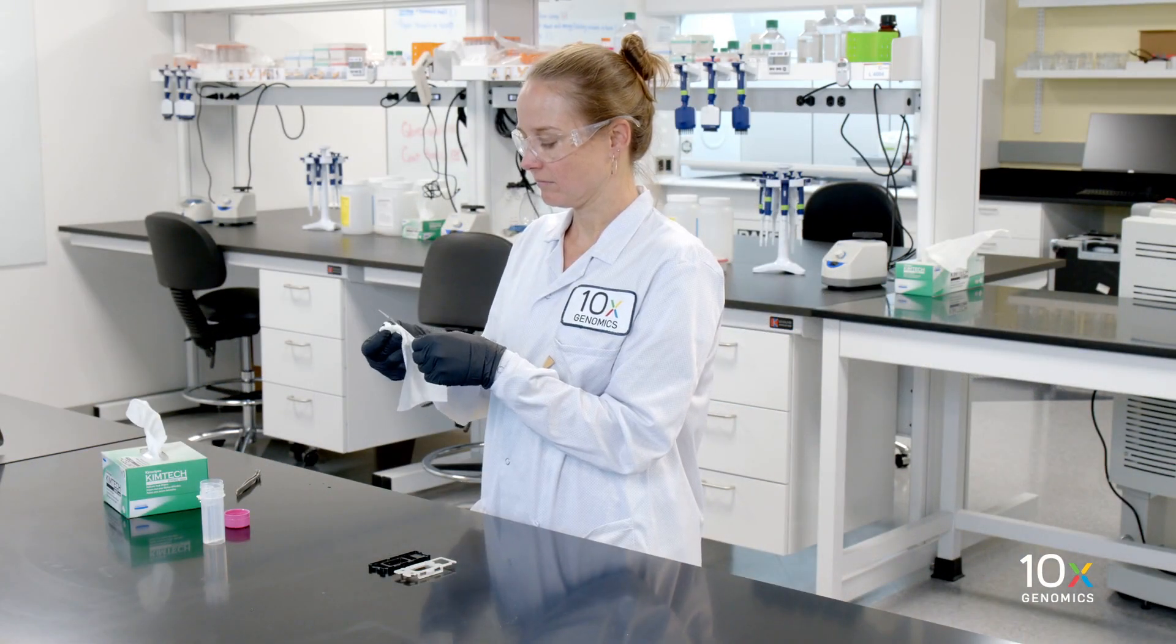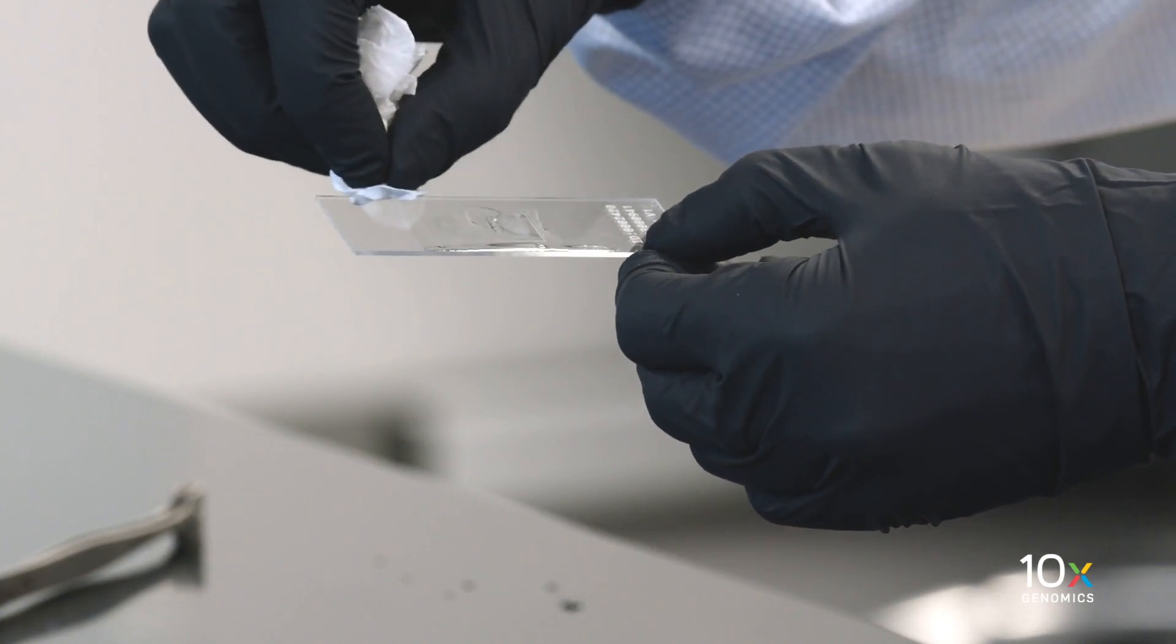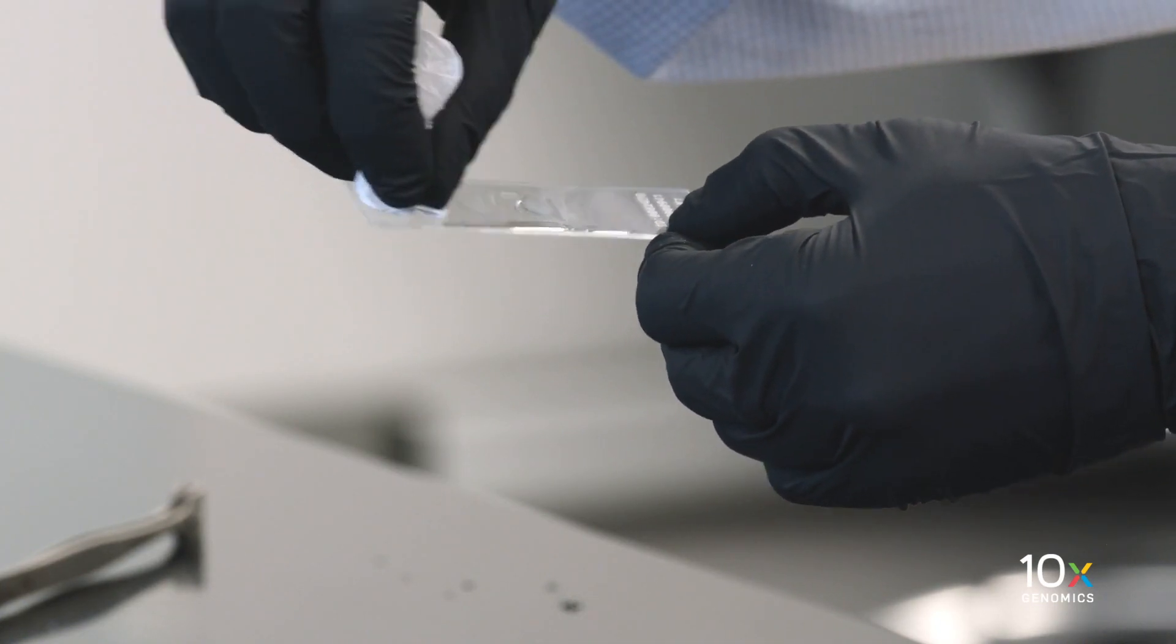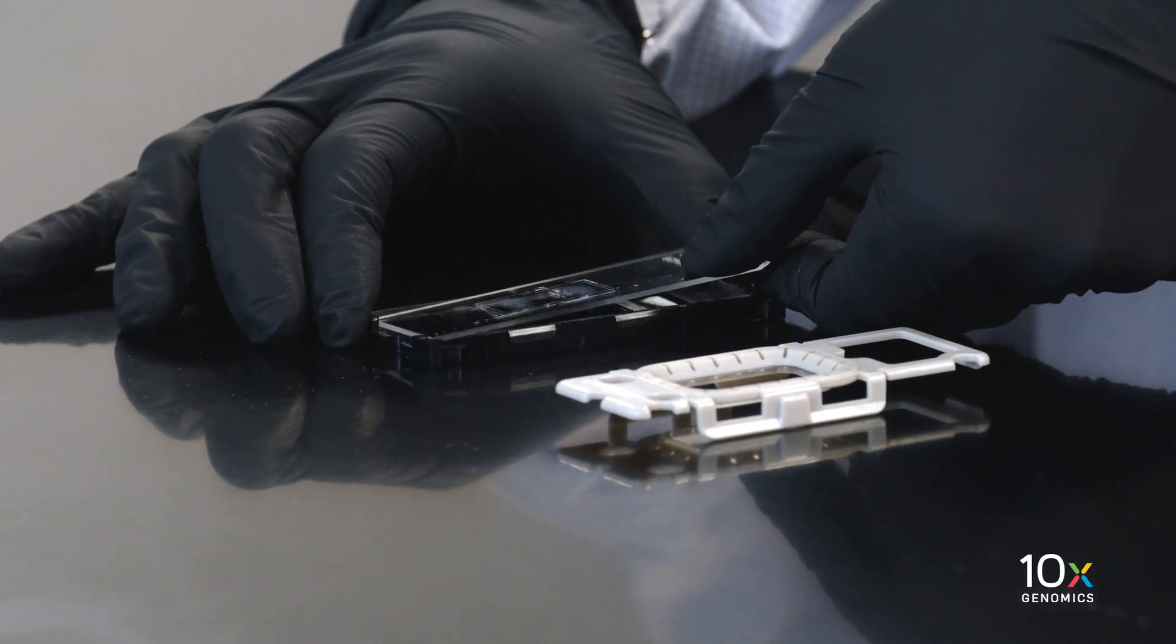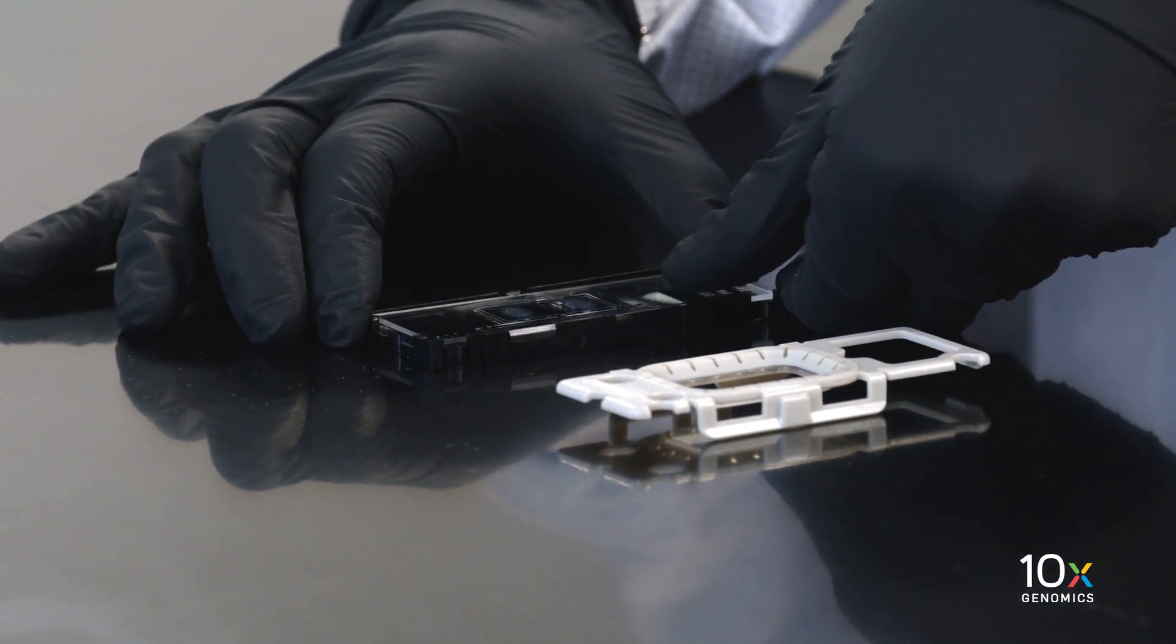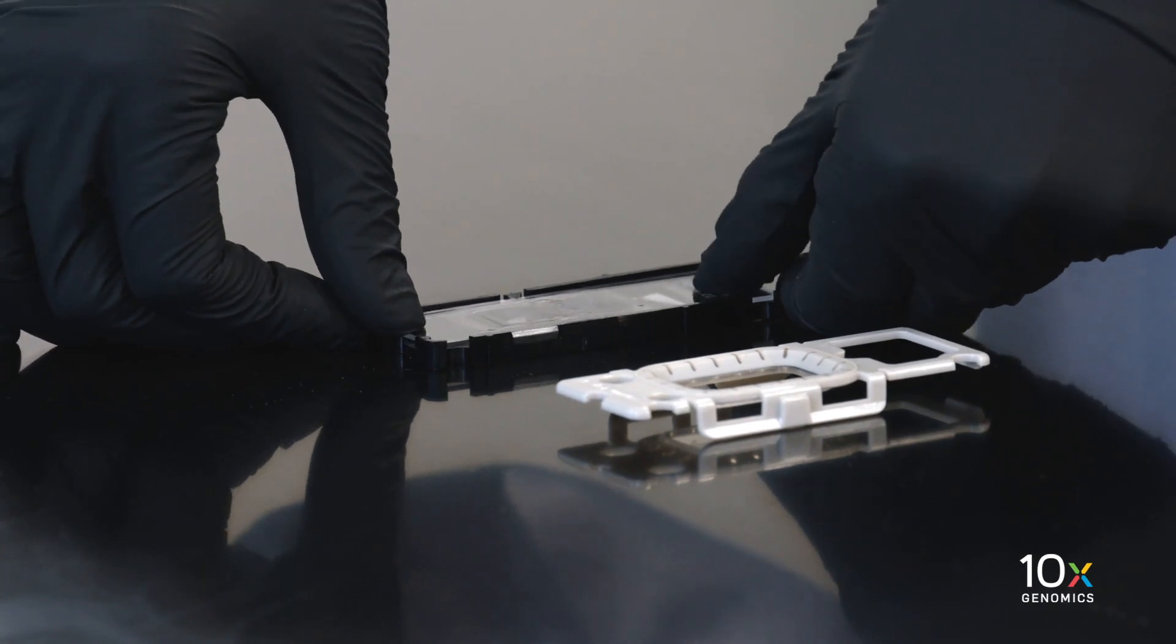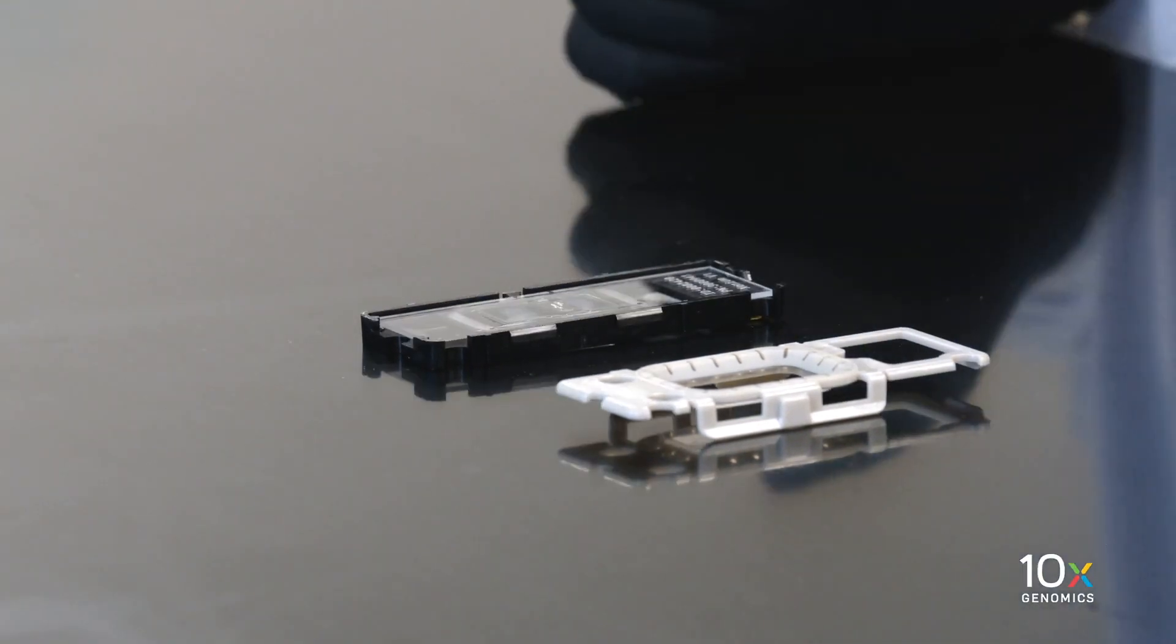Wipe the slide dry outside of the sample area with a laboratory wipe. Place the Xenium slide with the tissue side facing upwards into the bottom half of the cassette. Ensure the label is facing toward the bottom of the cassette. Press the slide down into the grooves of the bottom half of the cassette until it sits firmly in place.